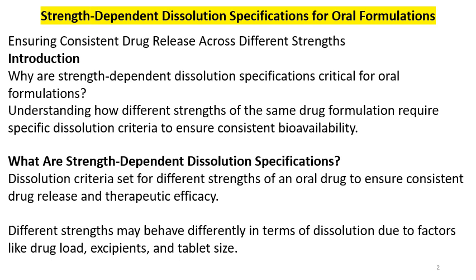Dissolution testing is for ensuring consistent drug release across the different strengths. The dissolution profile directly affects the in vivo behavior, and it is linked with safety and efficacy. So the dissolution specifications for oral formulations should be consistent.